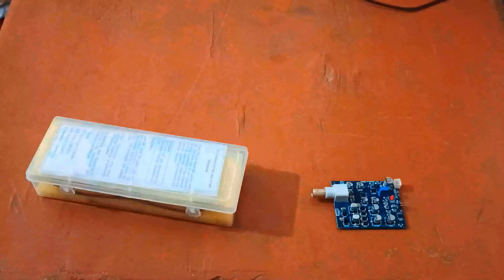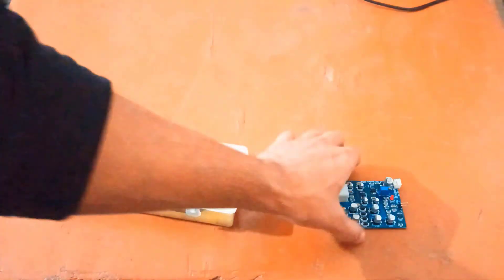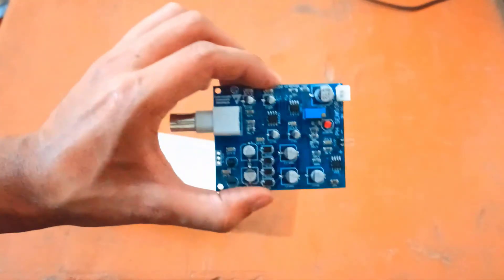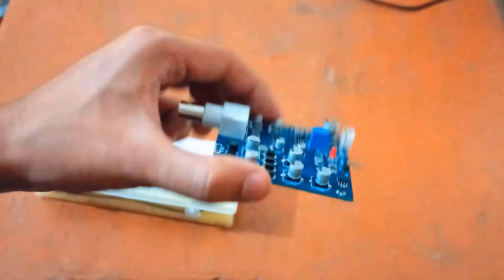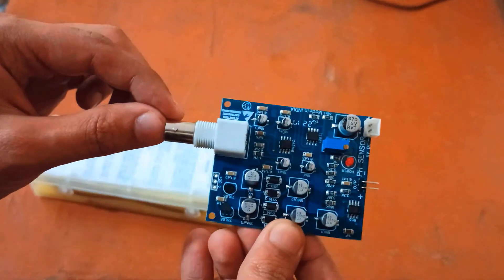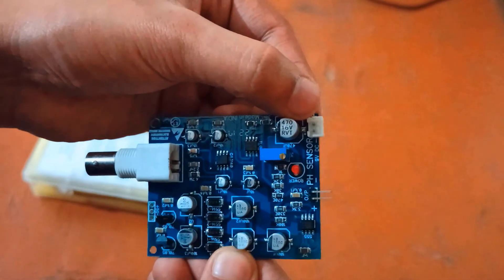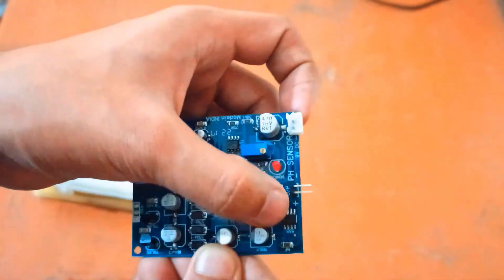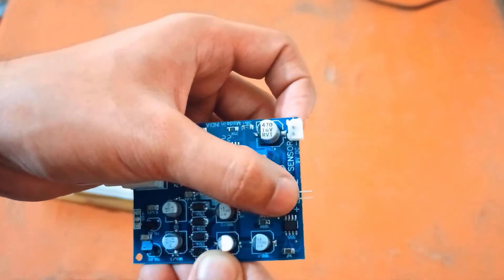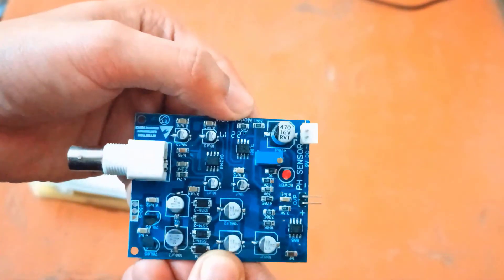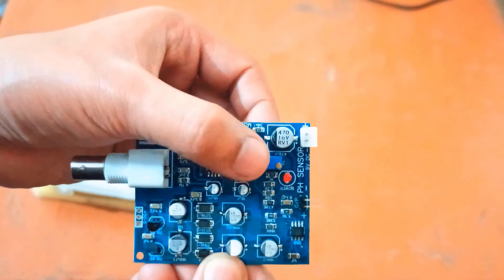Now let's see the pH sensor kit. This analog pH meter kit with industrial real-time online electrode is specially designed for Arduino and other microcontrollers. This is the main signal processing board which has a BNC connector. This is the power supply pin that accepts 9 volts DC supply, and these are the output analog pins that give the result as output. There is a potentiometer that is used for calibration.